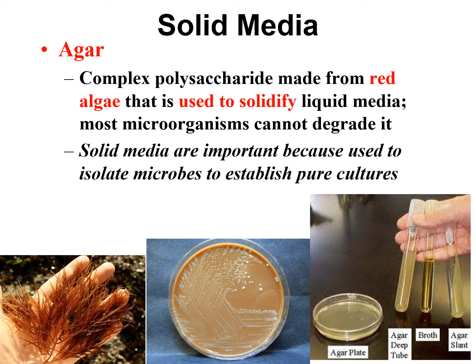So when you obtain a pure culture, you need to be able to spread the microorganisms out so you can get these individual colonies like we're seeing on this petri dish here. Because then you can pick them off and go identify them and find out which species is growing there. The microorganisms can't eat the agar, so that makes it really nice to obtain pure cultures by using this solid culture media.